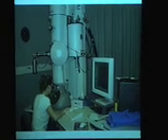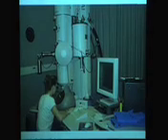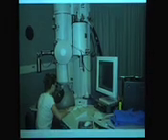It's a so-called Polara from FEI, and it's a 300 kilovolt machine, which can actually use helium as a coolant, but we normally operate it with liquid nitrogen. So this is a very powerful machine that we're going to transfer to Columbia. I recently moved from Albany to Columbia University in April, and we will have the microscope installed here soon.